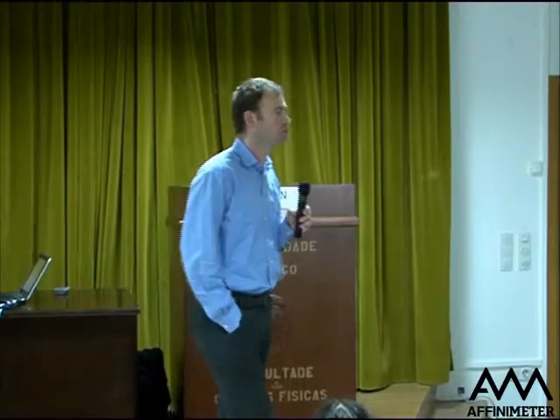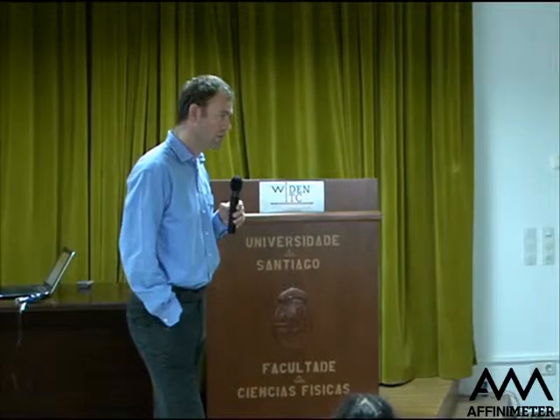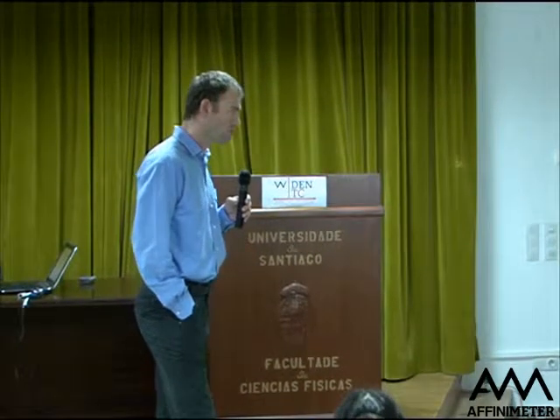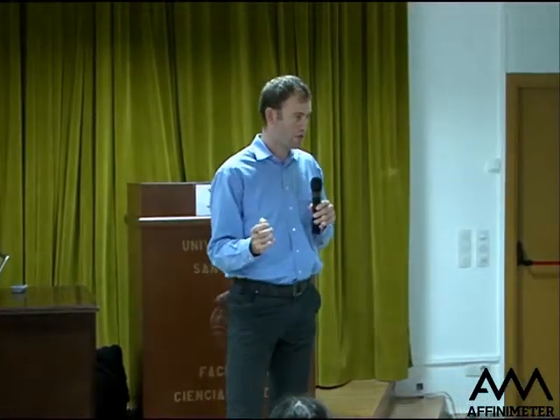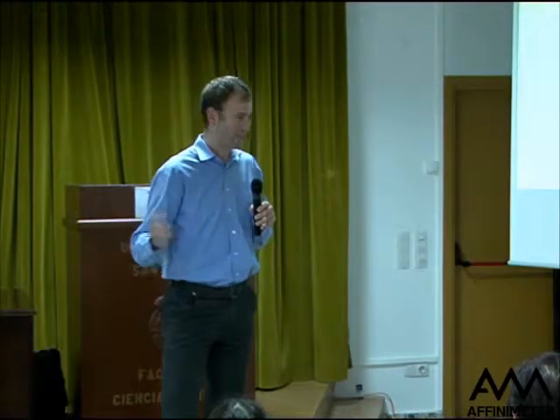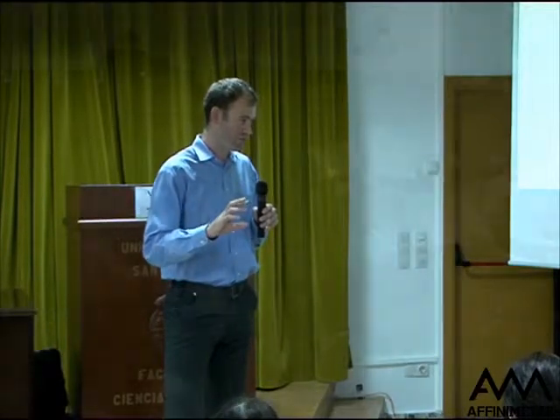Would I ever want to decide that something makes a hydrogen bond based on ITC data alone? The answer to that is probably no. However, if I had a series of structurally similar compounds binding to the same target, and I could introduce or take out that hydrogen bond, I would probably start to consider interpreting that data in terms of whether the hydrogen bond is there or not.